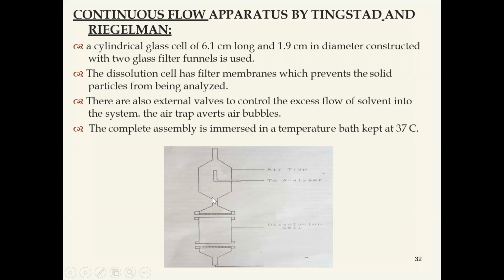And this dissolution cell has a filter membrane. That membrane will prevent the solid particles from reaching the analyzer. And here one more provision is there for an air trap. And here, this is the analyzer.